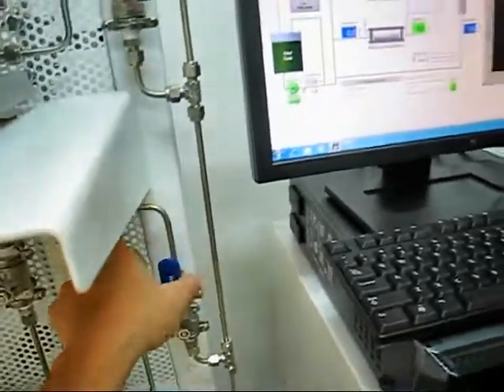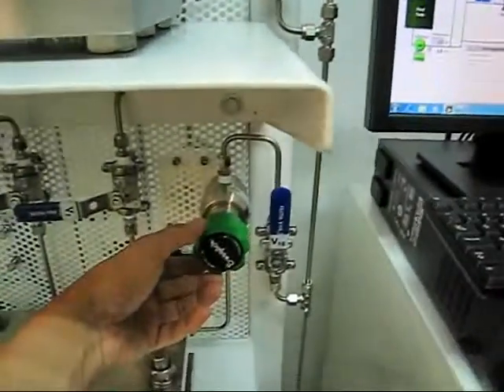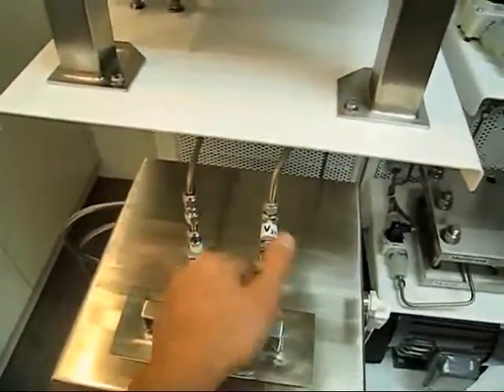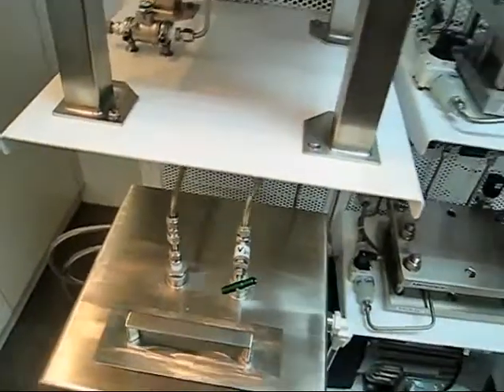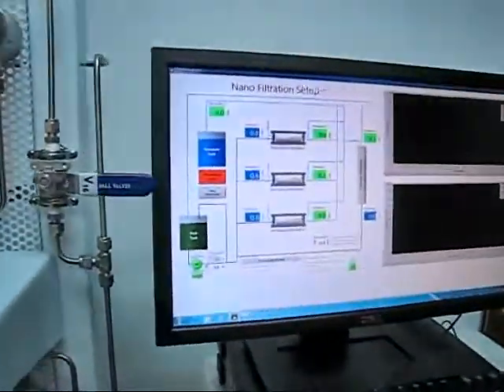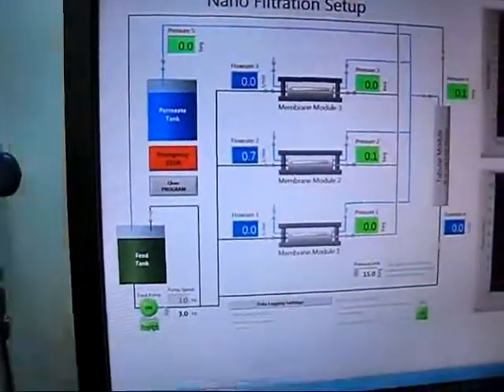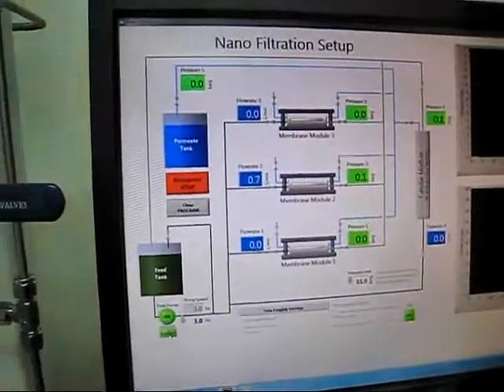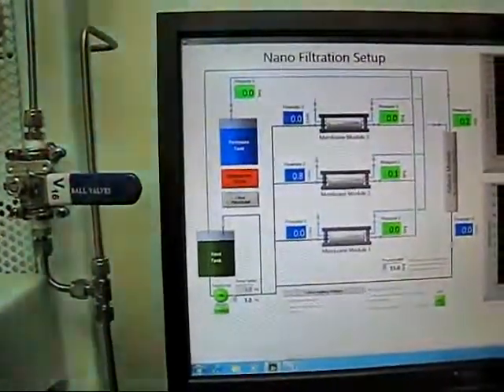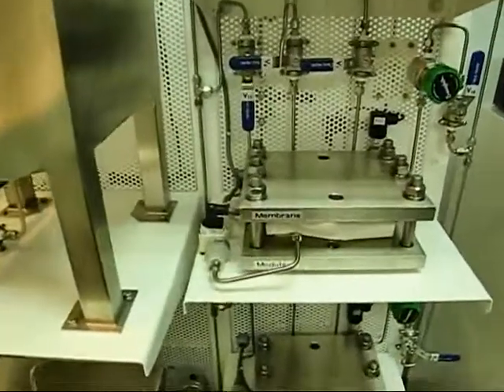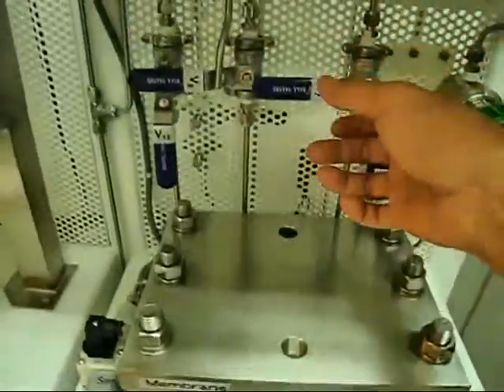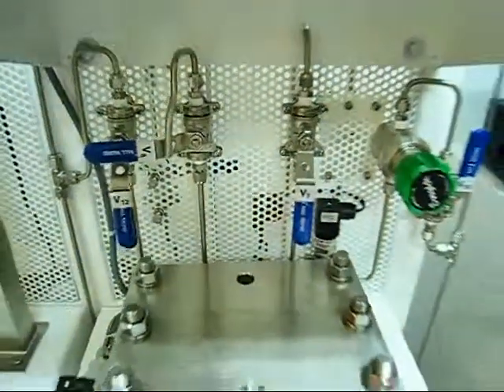Again, there's no back pressure set on the system here. We're going to shut off the bypass so that the liquid will go straight into the valve and into the membrane. This way you're able to see that the flow rate into the membrane is increasing slowly. At about 3 Hertz you get a relatively slow rate. Because this is a brand new membrane, I'm going to treat and run the system very carefully starting at very low flow rate.